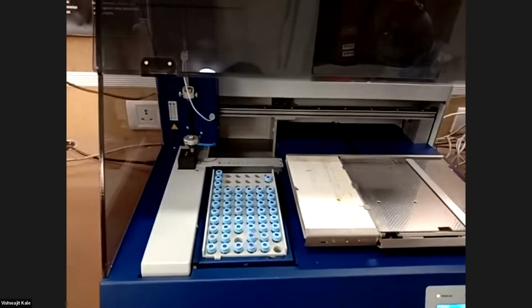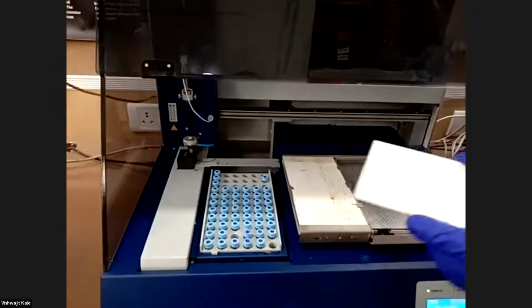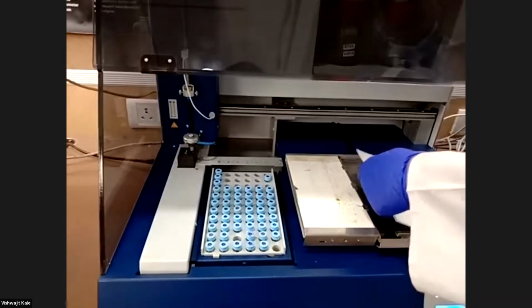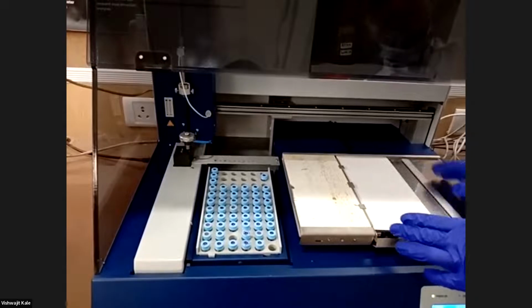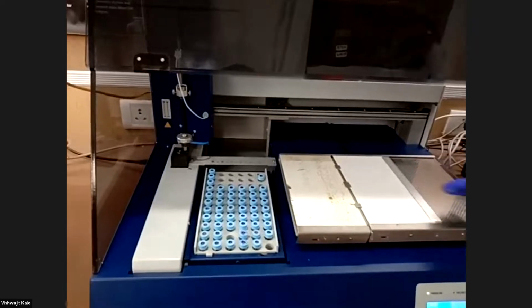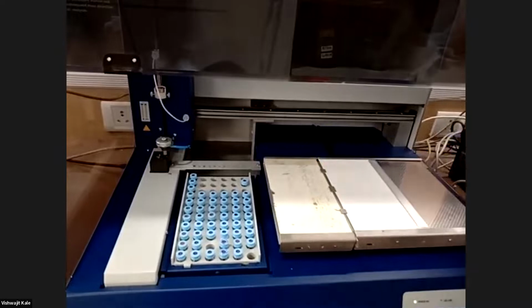on the plate. So this is the stage on which we need to keep our plate properly. It is compatible with 20 by 20 or less, any dimension of plate. So on this stage, I'm keeping my plate which I have marked already with pencil. I have marked the solvent front up to 70 millimeters. Then the application position I kept at this side in ATS4.